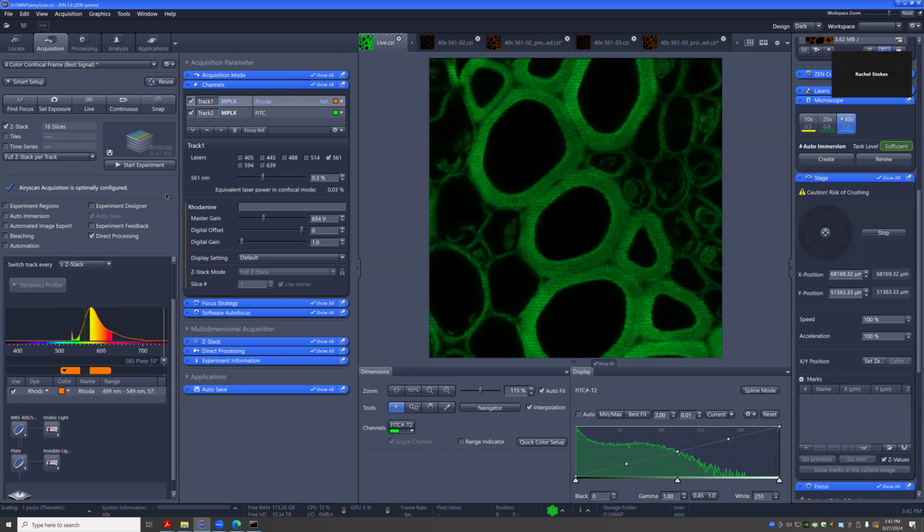You're like, oh, smart setup, you picked something dumb, this is not good for my sample. At that point you can completely ignore smart setup and do everything manually here and here. But as a starting point, I wouldn't do it like that. I would first start with smart setup, see what it suggests, and work from there. If you find ways to make it more efficient, add those manually, and then build from there.